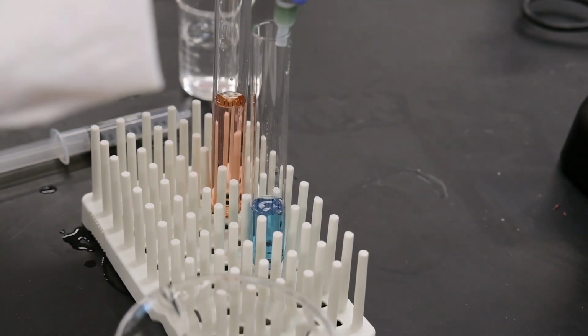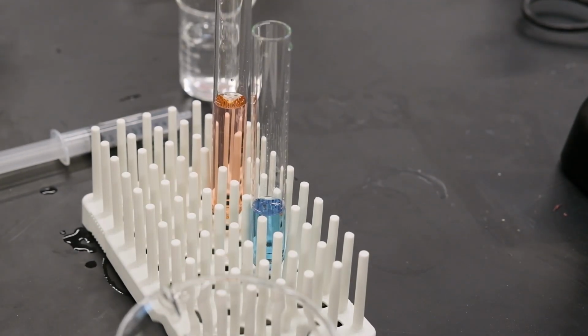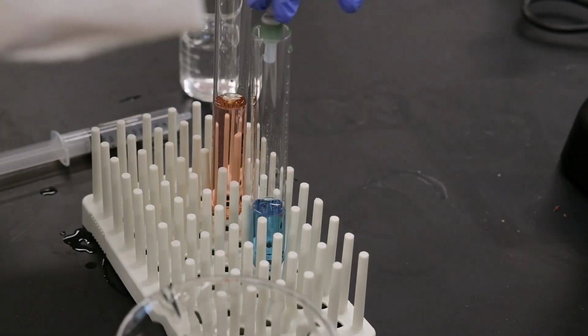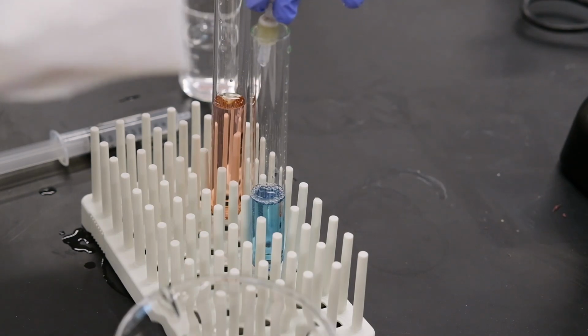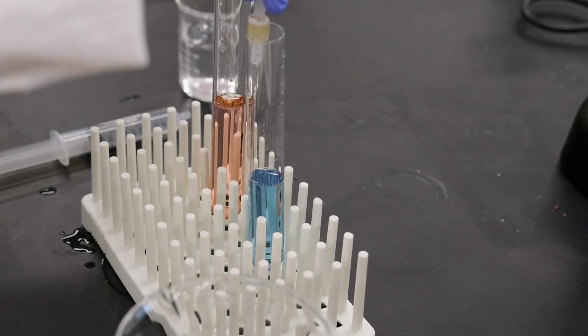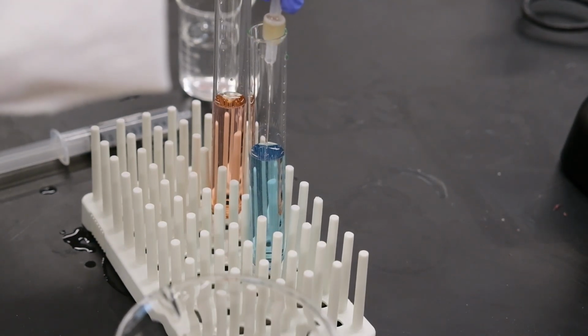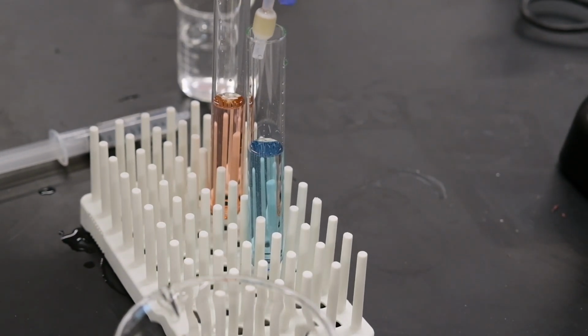We want to make sure that we collect all of it. So we elute our column with 25 more milliliters, of 25% isopropyl alcohol, excuse me, until the solution is clear and there is no more blue.